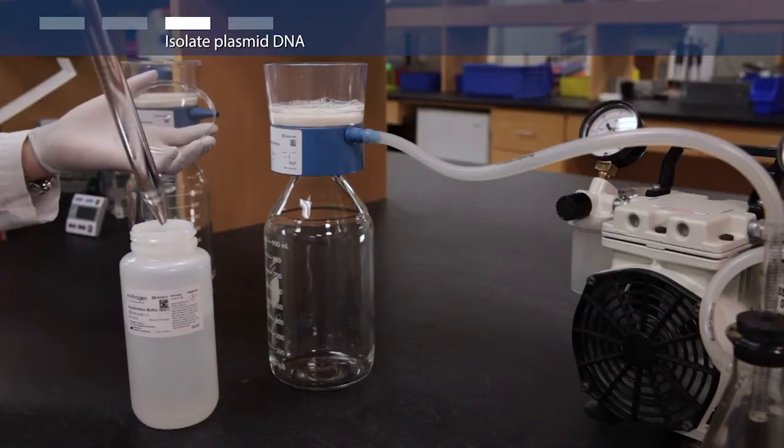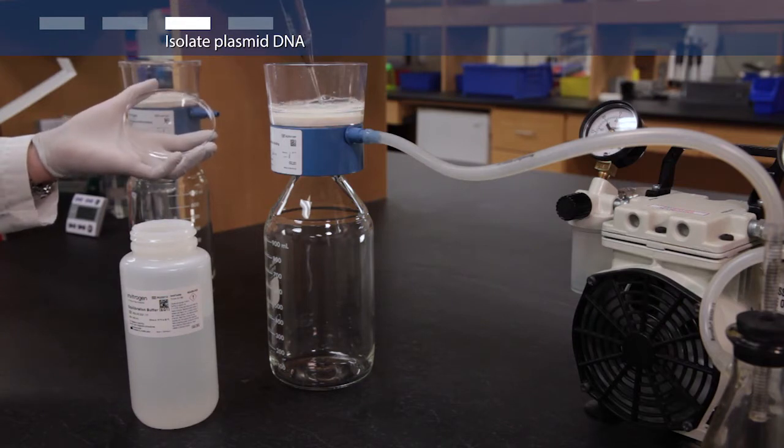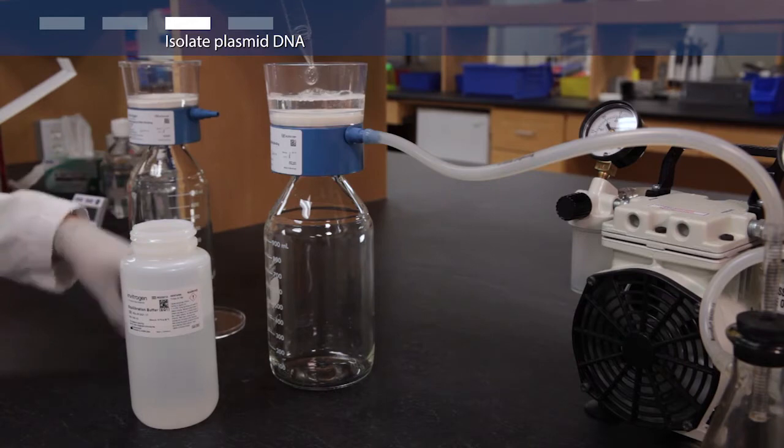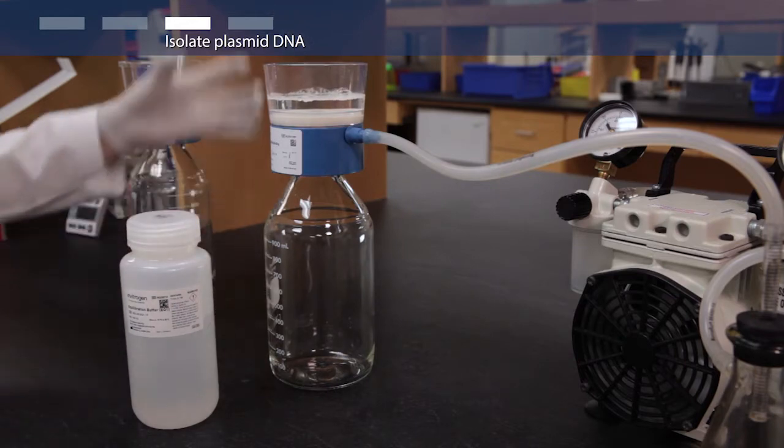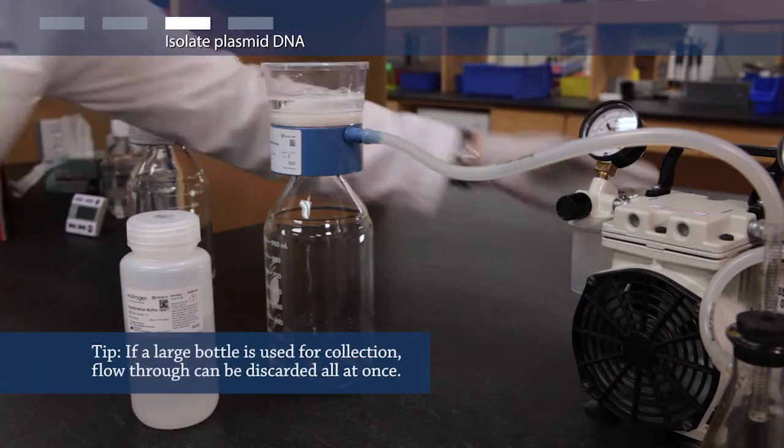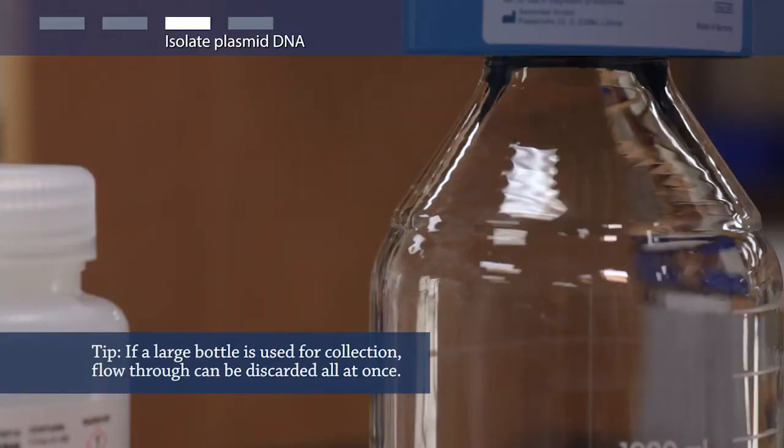Add 100 milliliters of equilibration buffer to a DNA binding cartridge attached to a receiver flask and vacuum. Apply vacuum, drain the cartridge, and discard the flow-through.